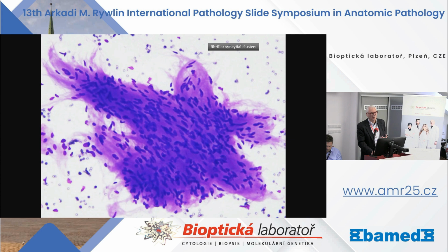Most of the time when we think about schwannoma or peripheral nerve sheath tumors in histology, we talk about the nuclei being buckled, or spindle shaped, or snake-like. Actually, on FNA, most of the time, I really don't see that very often. Most of the time, the nuclei are either ovoid, slightly elliptical, and occasionally sinuous or serpiginous, if you will, and even rounded, as you notice here.